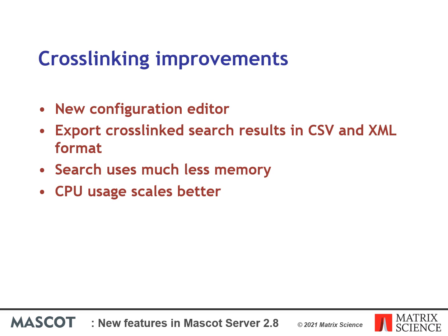If your search only uses intralinking, there should now be no limit on the number of proteins that can be intralinked. The cross-linking method still specifies a softer limit called max proteins, which is a safety valve for interlinked searches.